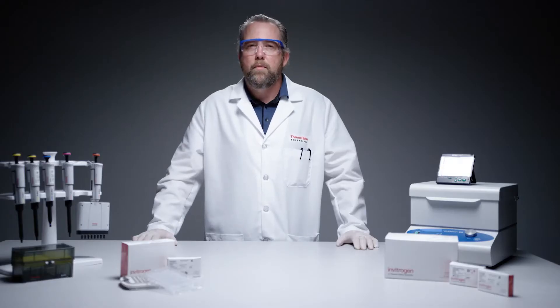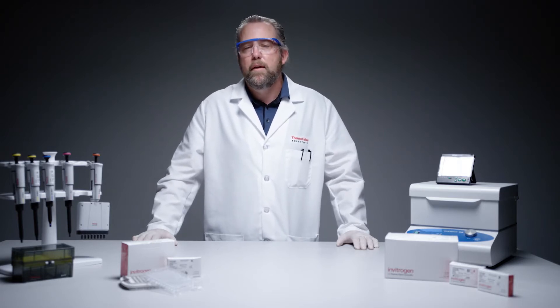Prior to setting up and running the Quantigene Plex assay, please refer to the how-to video to calibrate the shaking incubator to both 54 and 50 degrees Celsius using our temperature validation kit.